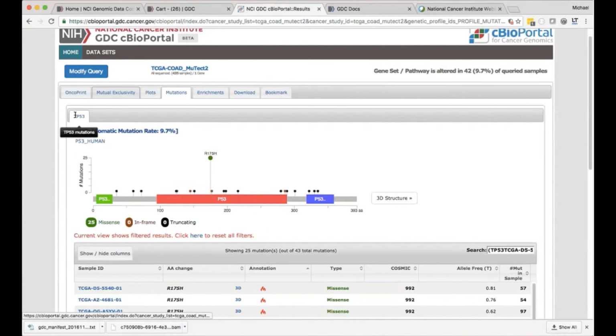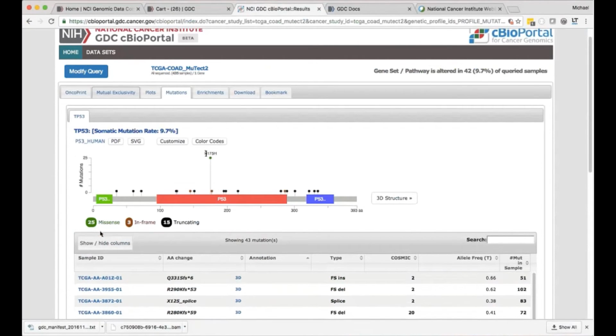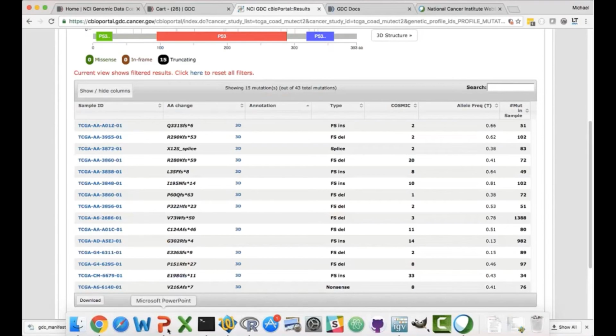Are there other types of mutations that do interrupt expression? We had been focusing on, or filtering for, those mutations that were this particular amino acid change. But if we look at just the truncating mutations, so go through the same process either in the portal or the API, download those RNA-Seq files, what kind of results do you get?